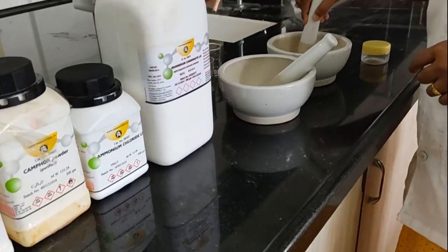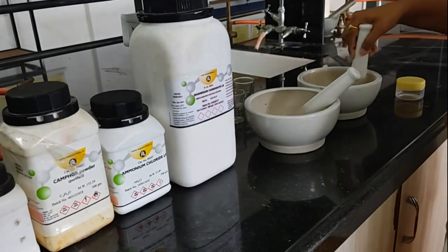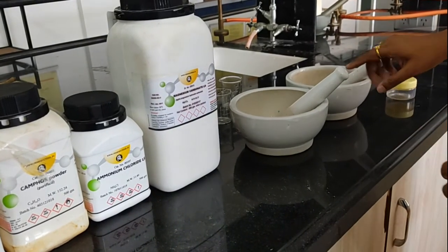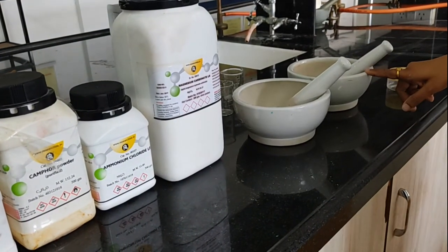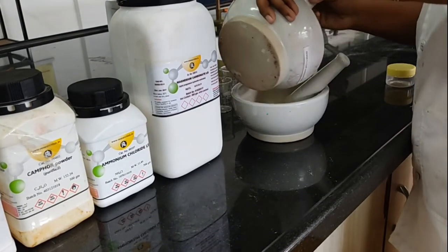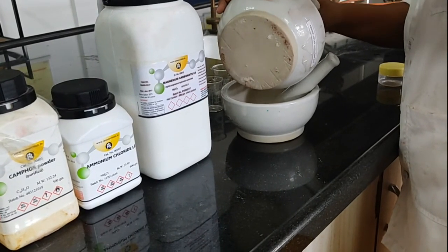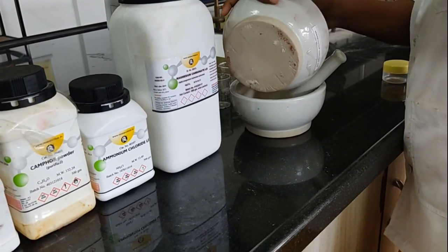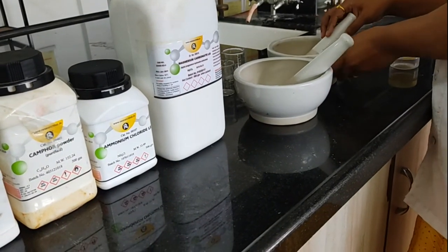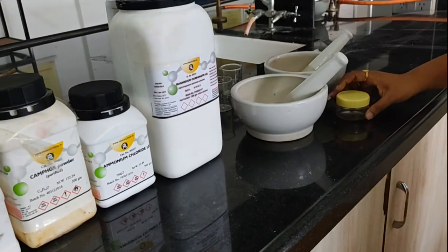After proper trituration of both the powders in both the mortars, I am going to transfer the powder from this first mortar into the other one. After transferring all the powder, now I am going to transfer it into this container, and then we will proceed to the next labeling part.